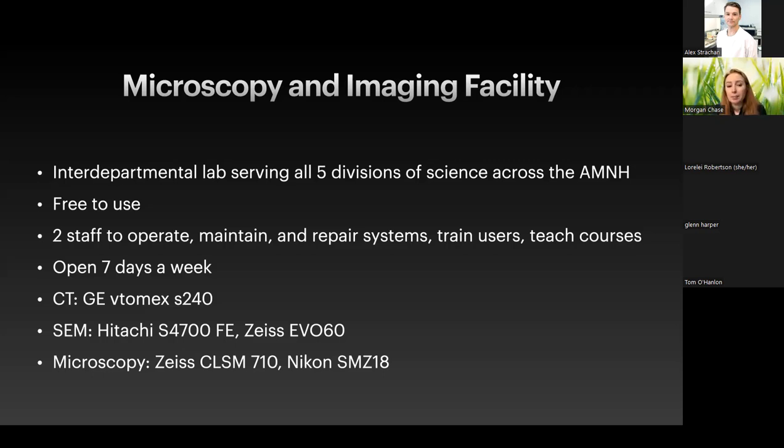And in addition to that, we have light microscopes, you know, our confocal laser scanning microscope. So that uses both light and lasers. And that was purchased on a grant from NASA. We originally were looking at Stardust, you know, a mission that flew behind a comet. And so they were looking at Stardust to learn about the origins of the solar system.